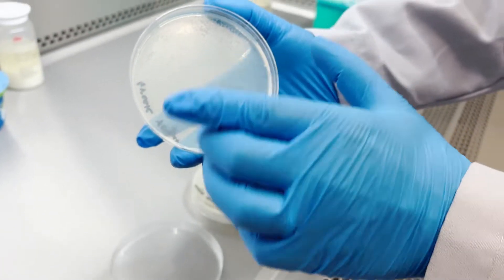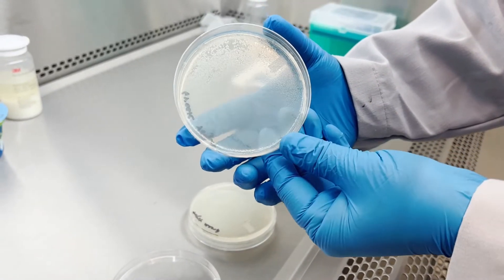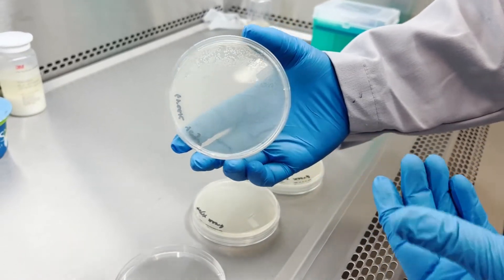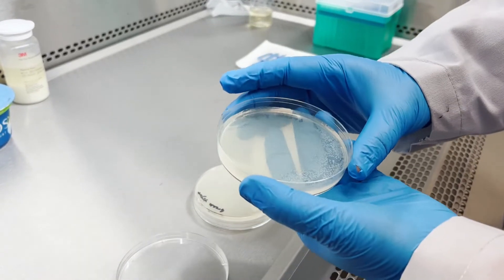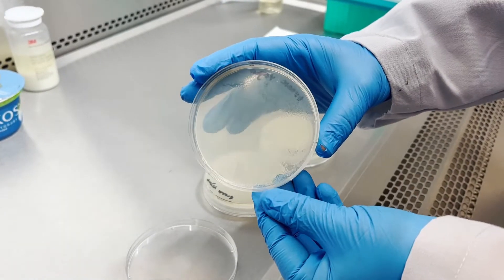These white colonies may be Streptococcus thermophilus or Lactobacillus bulgaricus, which are the common lactic acid bacteria in yogurt. So we are going to see how these bacteria look like under the microscope.